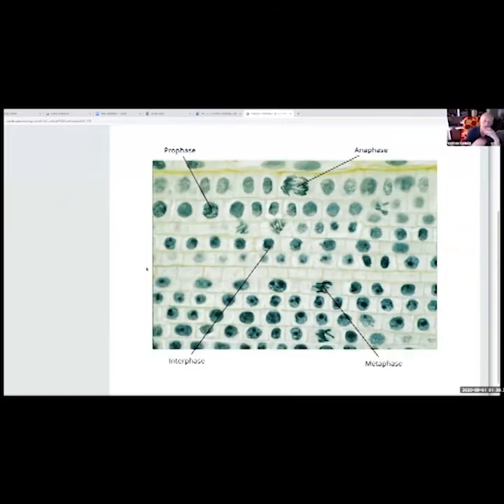Remember, this is a three-dimensional slice. So if you slice it where one of the layers doesn't have the cells, if an onion skin's round, it's only going to slice one of those layers like that. You can see the line above it is not real dark. It gets darker as you go. It all depends on how you cut the line through it. Does that make sense? Yeah, thank you.